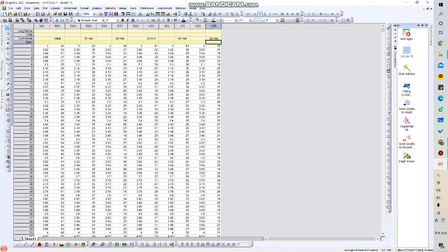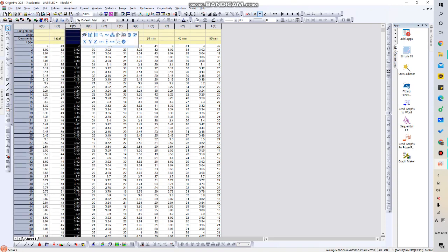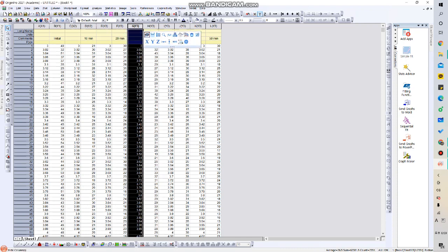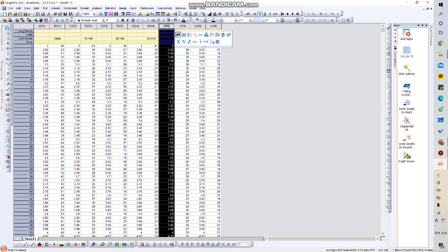In some cases, like using DSC or TGA graphs, the x variables are different in every analysis, so you cannot just make them all into one x-axis and the rest all y. But in this case, you can see that all the x-axes of the PXRD graphs are the same because we programmed it to increase 0.02 degrees.